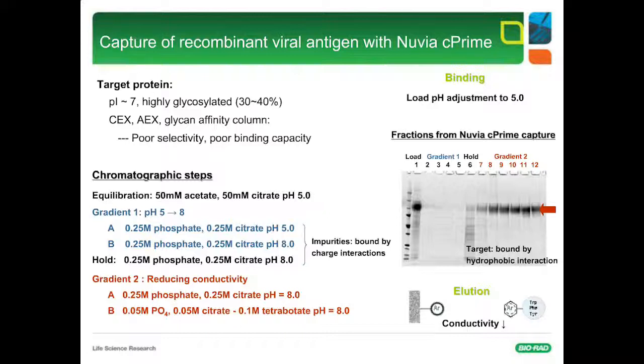So I would say the short answer is yes, and I would focus also on CHT. We've talked quite a bit about CHT today in the background. It still remains a very powerful tool because of its chelation and cation exchange selectivity. So let's not discount that as a potential tool.